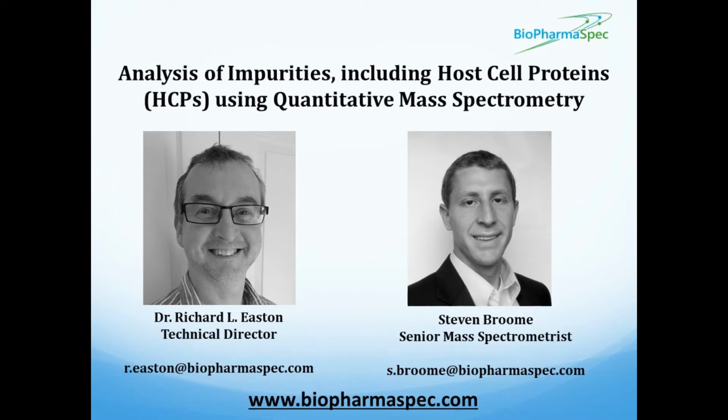Yeah, thanks for talking to me, Richard. And yeah, impurities are really important to test, and they have very big effects on the safety and the efficacy of your product. There are really two main concerns surrounding impurities. The first is that impurities can invoke adverse effects in patients, such as immunological responses. And the second is that impurities can have adverse effects on the product itself through modifications to the product, like oxidation or aggregation or truncation, just as a few examples. And these changes to the product can negatively impact the effectiveness of it and the shelf life.